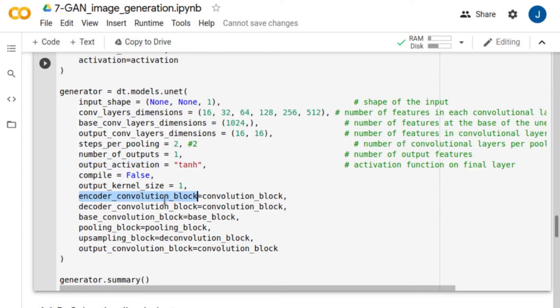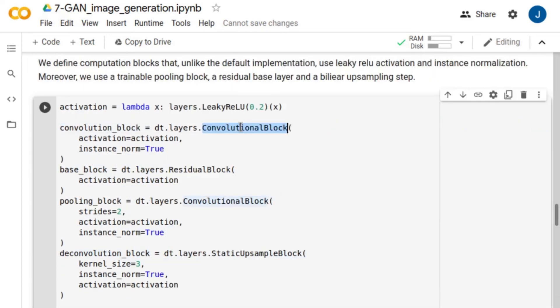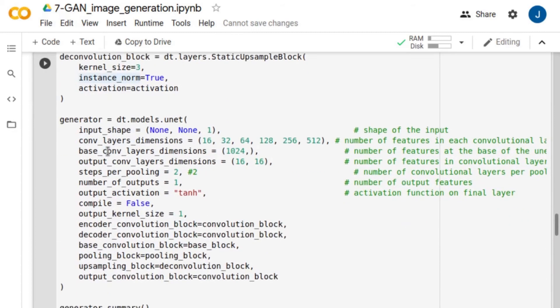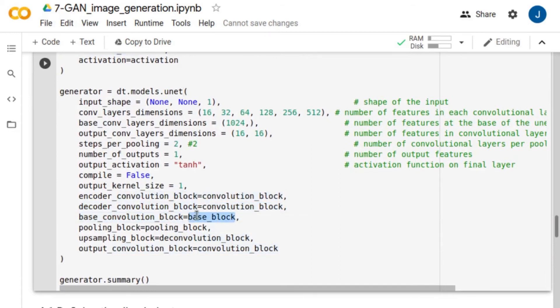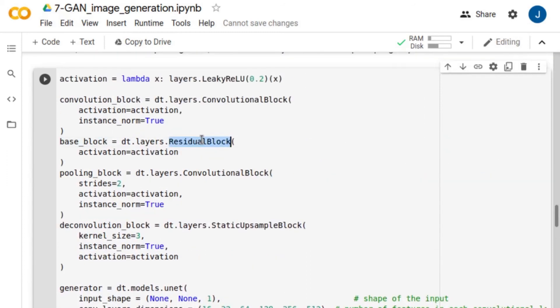For the encoder, we use convolutional layers with leaky ReLU activations and instance normalizations. We also use convolutional blocks for the decoder. At the base of the unit, we use ResNet blocks.